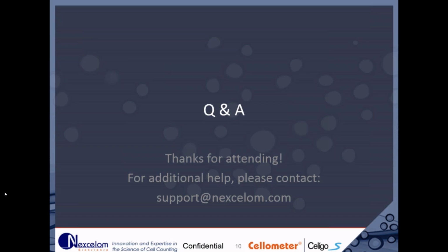And for the dendrites, or if you have things that are going beyond the nuclei, then you could probably use the merge application, which would pick up things beyond the nuclei area. And I have some other ideas of some other applications you could use. So I would start with the merged expression analysis. And if you want, in an online session, I can work with you. And maybe from that information, I can drum up another webinar in the future to cover those abnormal cell types. So call me, or email support, and we can do an online session together, okay?